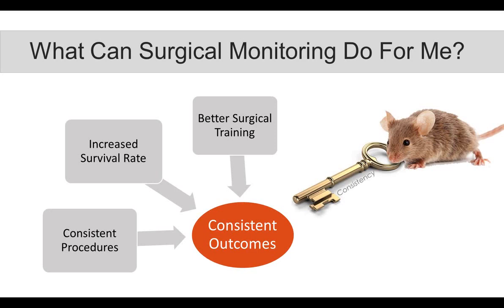And then the long-term survival rate coming out of surgery and going into the study group ends up being significantly higher. And lastly, it's a tool to pursue the whole idea of continuous improvement and training new people coming into the lab. Because when you're trying to learn new surgery techniques, it's very, very overwhelming to keep track of the ECG, the heart rate, the respiration, the core temperature, while at the same time paying attention to all of the challenging nuances that is microsurgery on mice and rats.